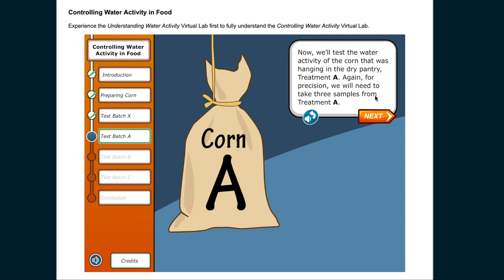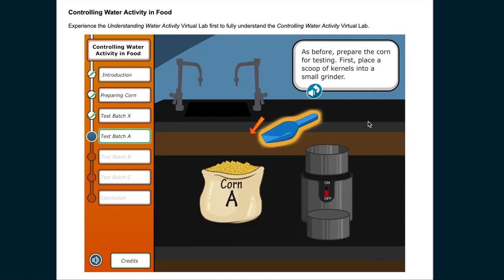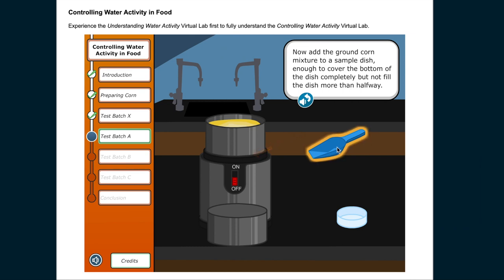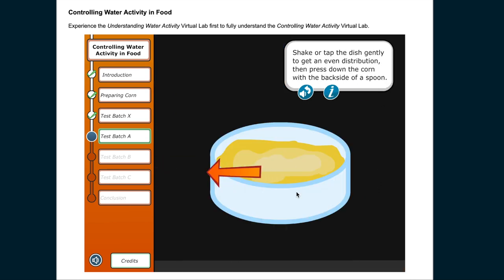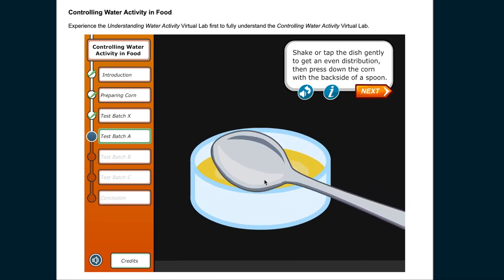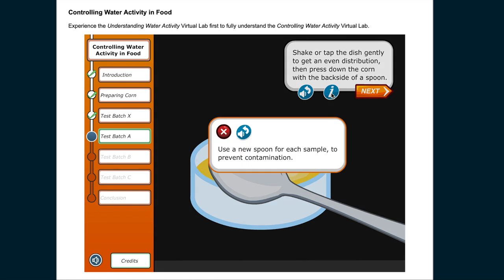Again, for precision, we will need to take three samples from treatment A. As before, prepare the corn for testing. First, place a scoop of kernels into a small grinder. Grind up the corn. Now add the ground corn mixture to a sample dish, enough to cover the bottom of the dish completely, but not fill the dish more than halfway. Shake or tap the dish gently to get an even distribution, then press down the corn with the backside of a spoon. Use a new spoon for each sample to prevent contamination.